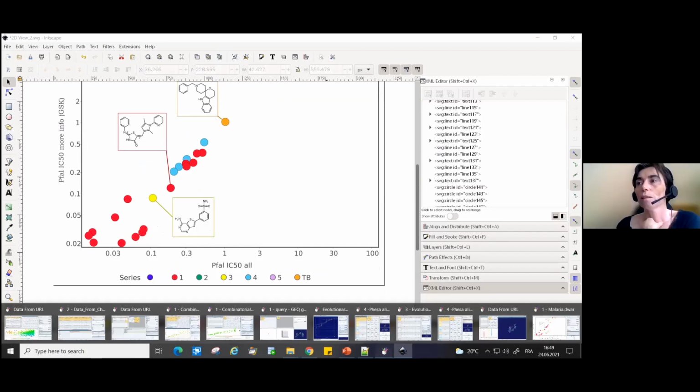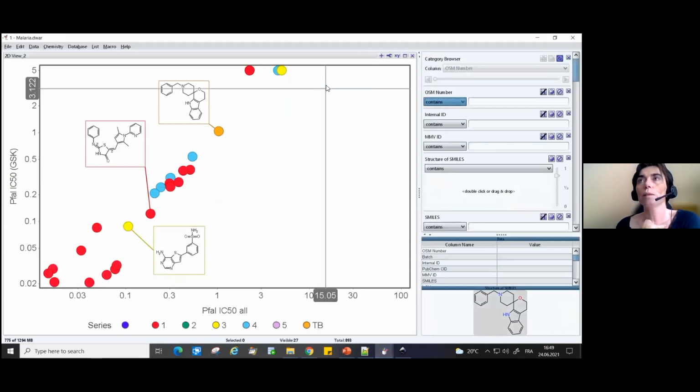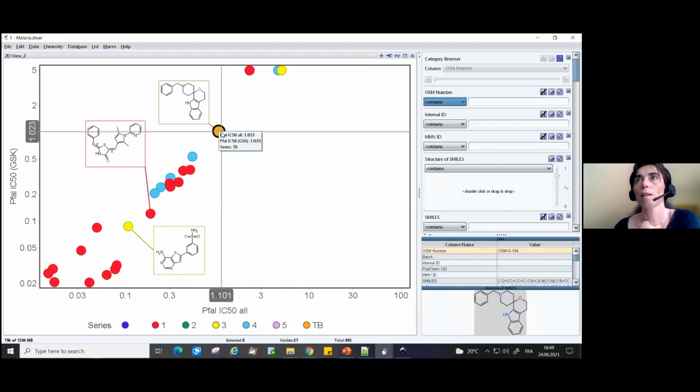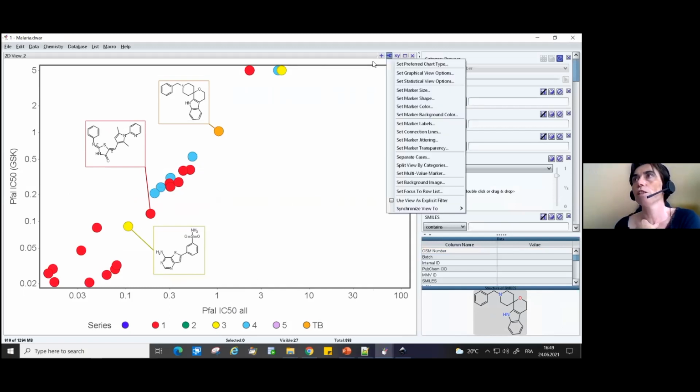And one thing too, if you want to work with Inkscape, these objects, so the dots, they are actually made of two things. So the background is one object, and the circle around is also another object. So it's easier to work with the picture in Inkscape if you change that.